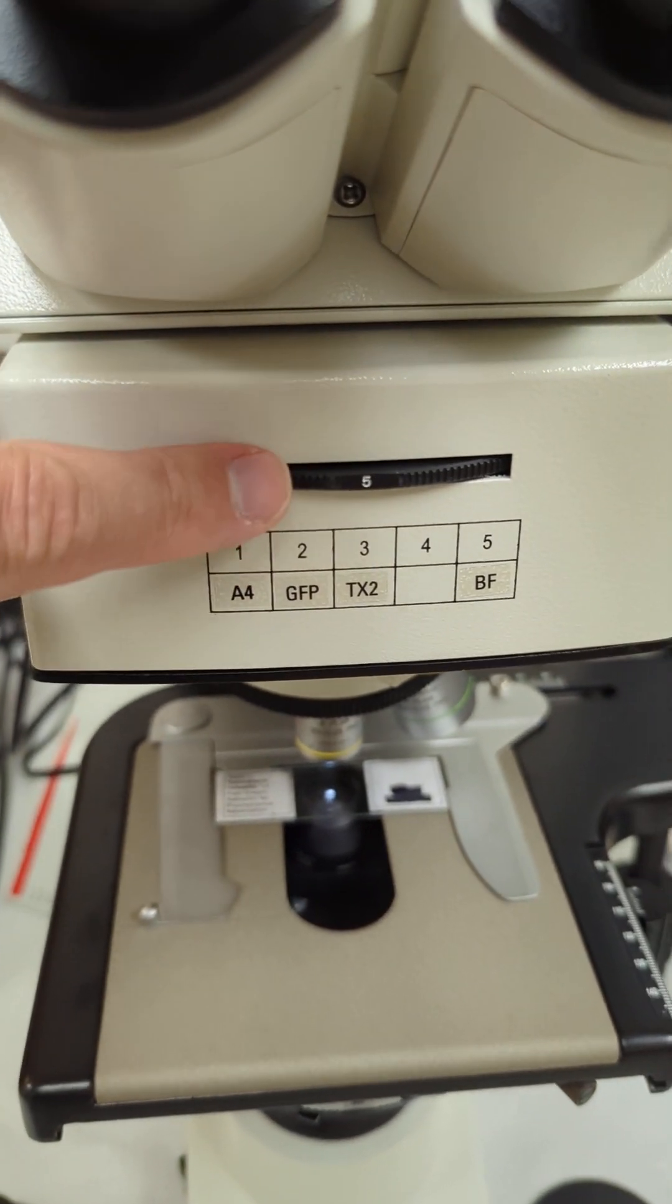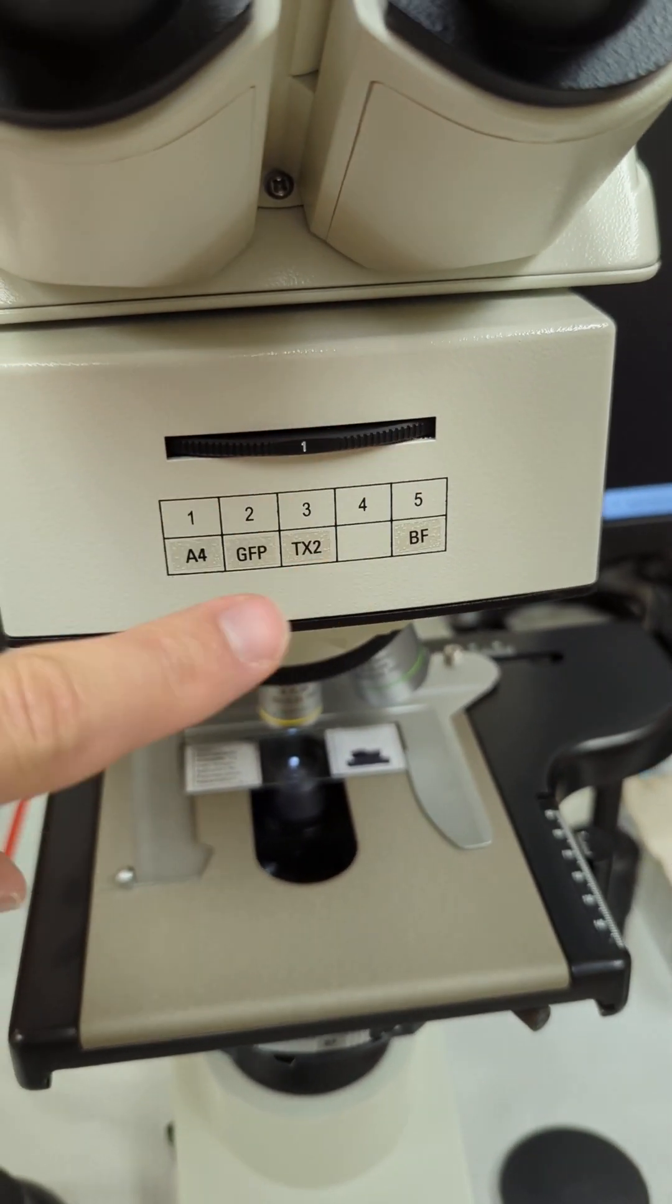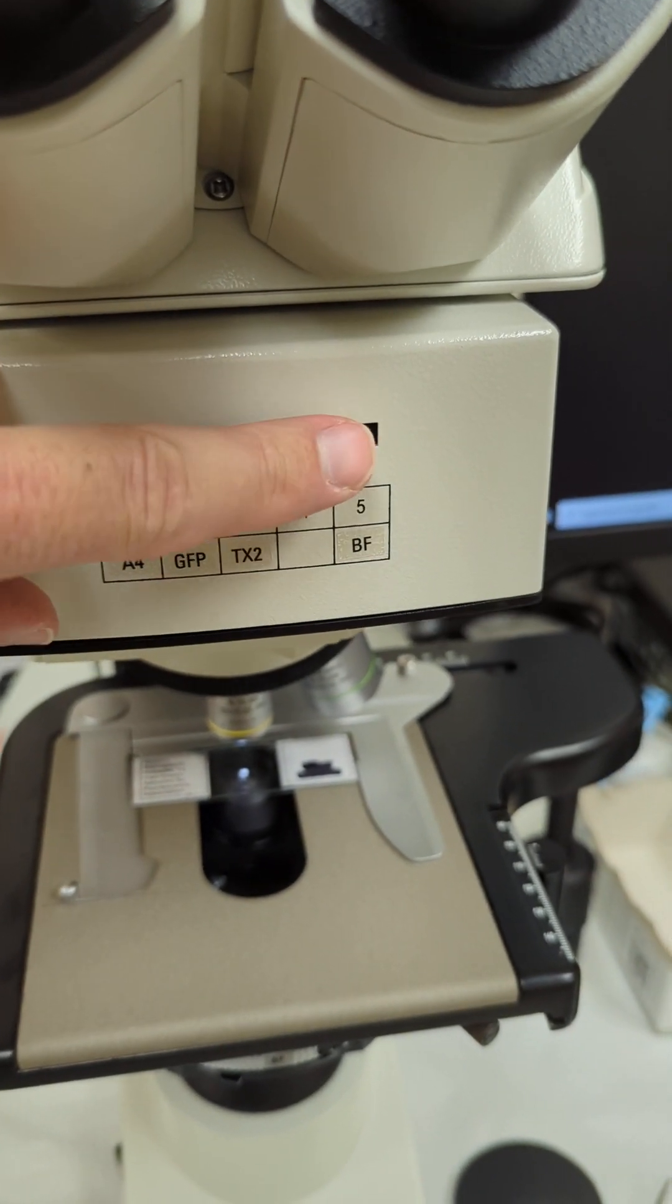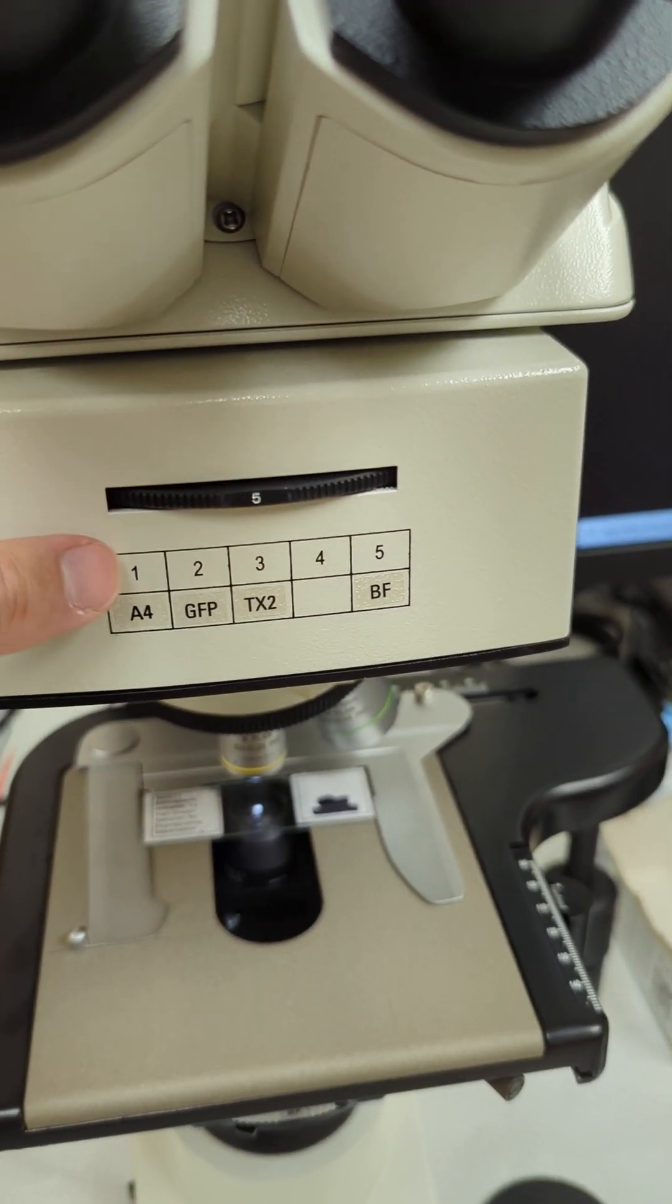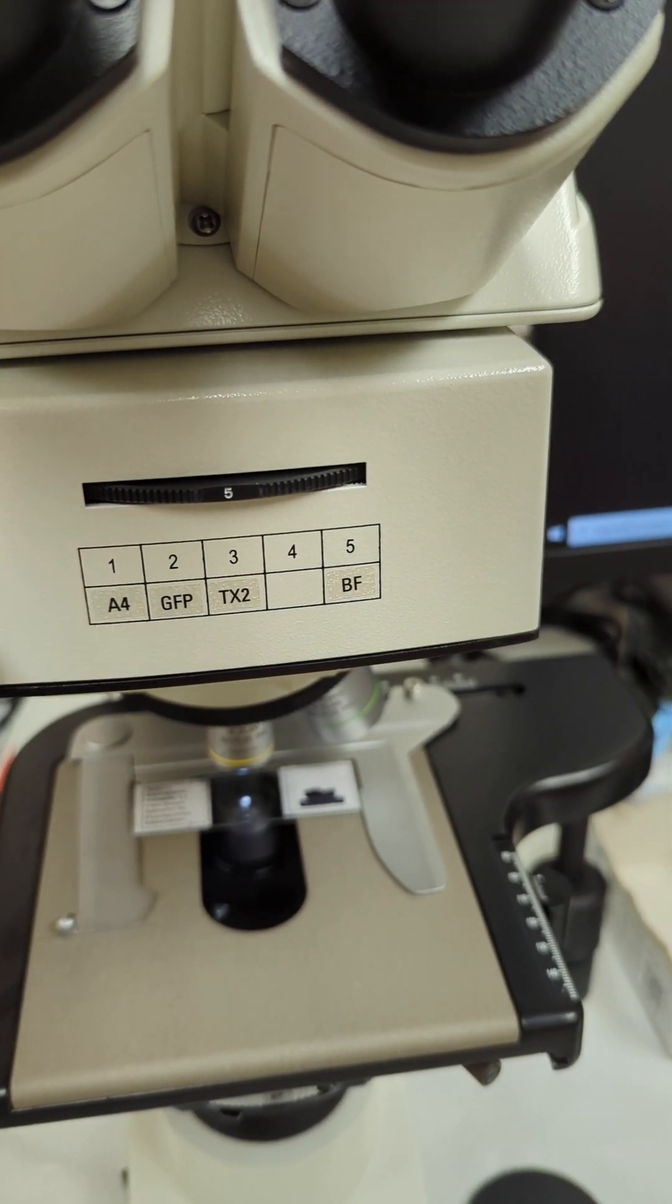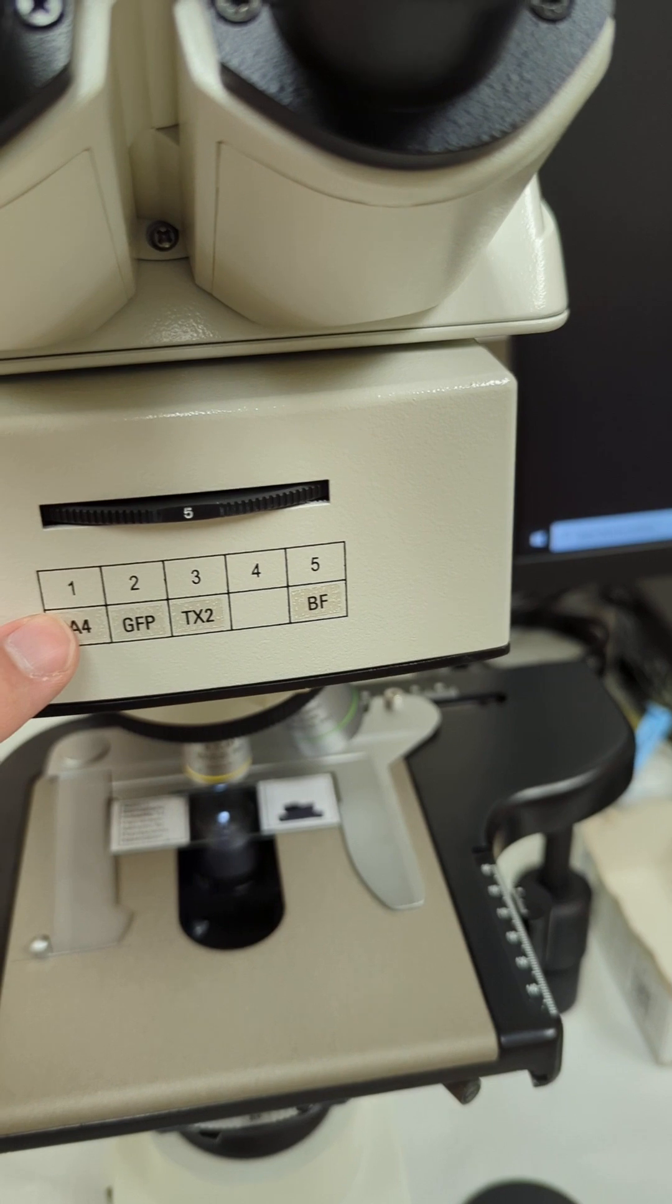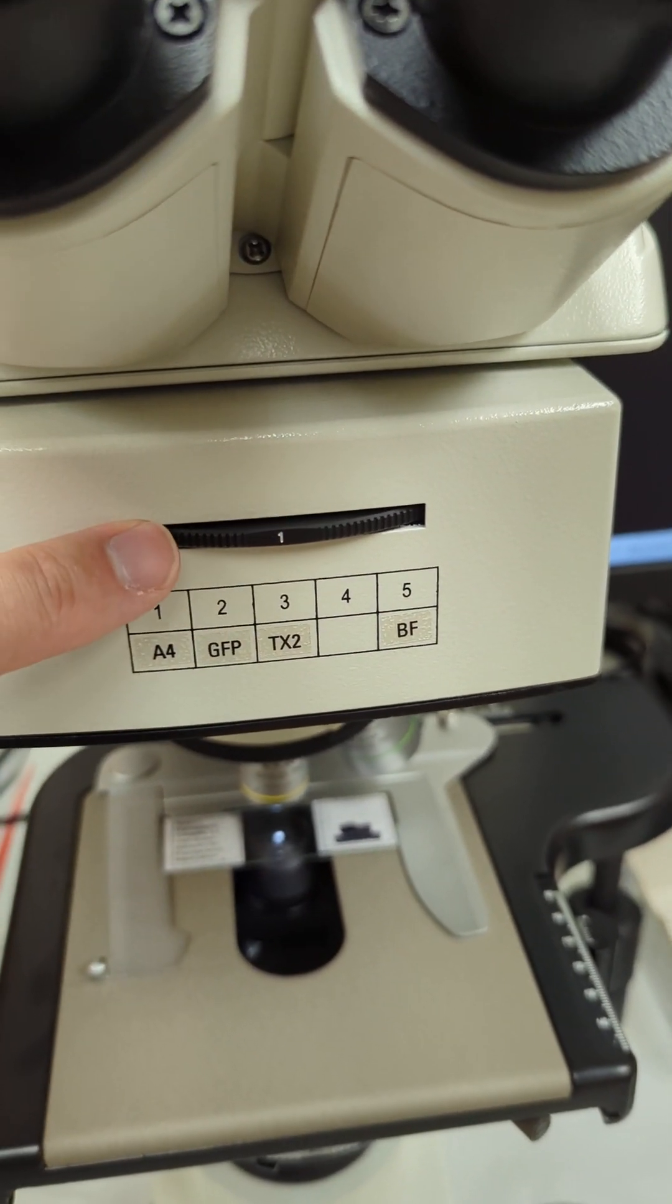There's a reason for that. As you switch, this is your turret. Switching to number one, which is your DAPI cube, and back to number five is easy because they're opposite, next to each other in the turret.